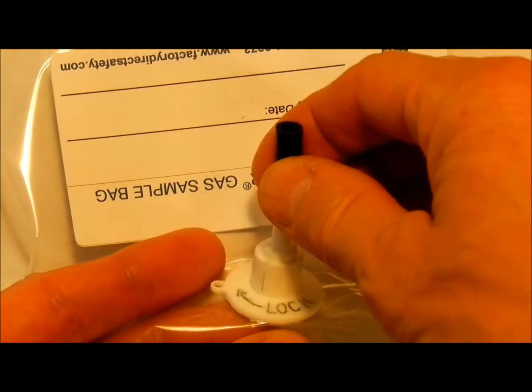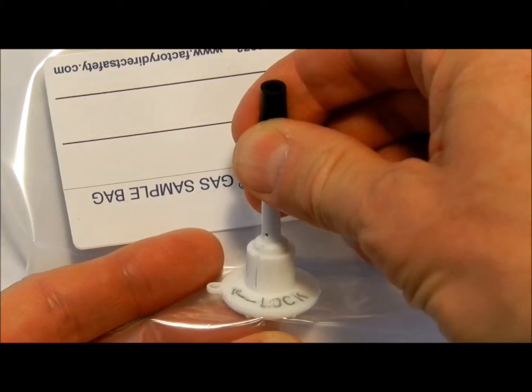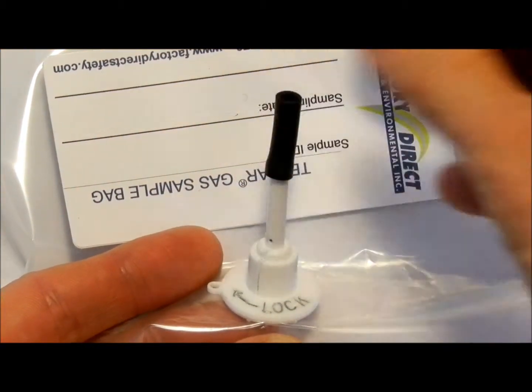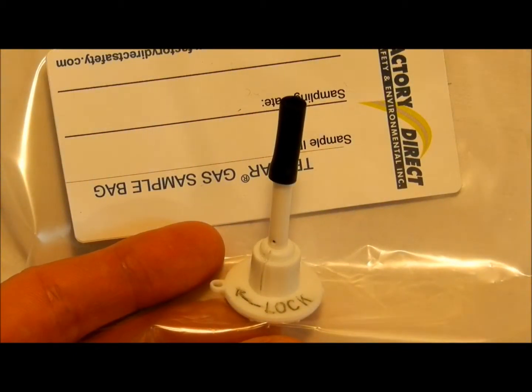To close the bag, pull up and rotate the dot until it aligns with the lines into the lock position. This seals the bag from having gas escape or enter.